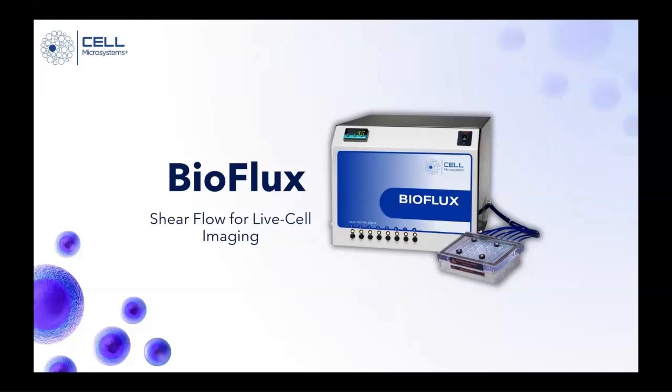Okay. The next question is, do all cells benefit from shear flow? Well, it depends. There are some cells that are under constant flow within our body, for example, endothelial cells that are lining our vessels. Because these cells in vivo are under constant shear flow, they do definitely benefit from being studied under the same conditions in which they're found in vivo.